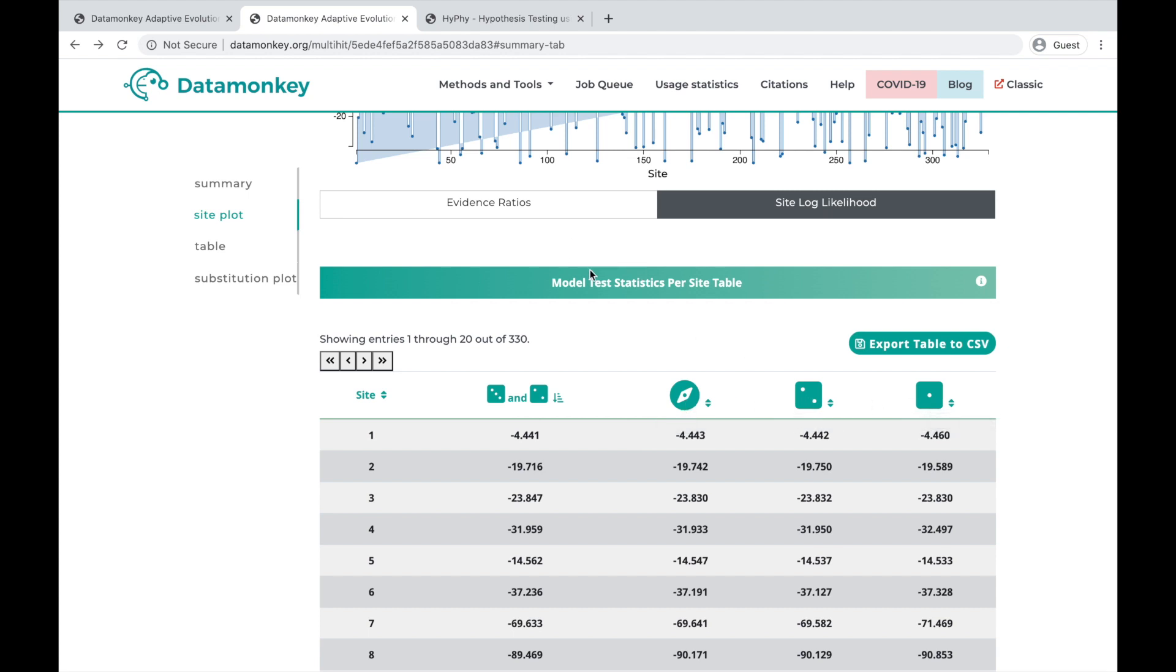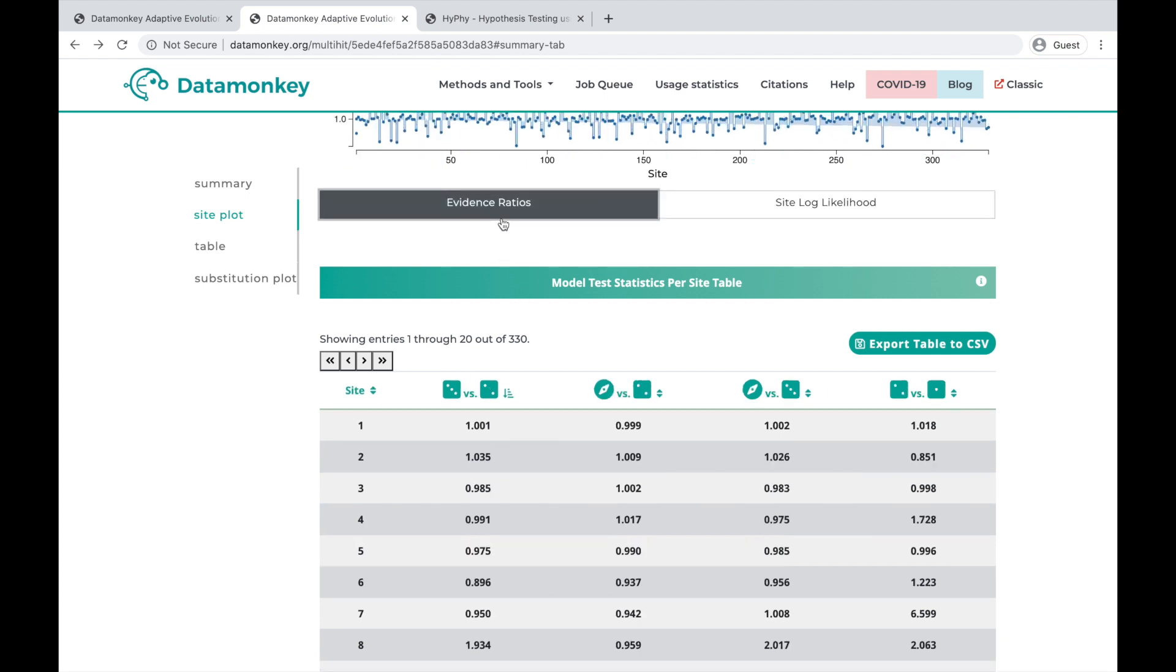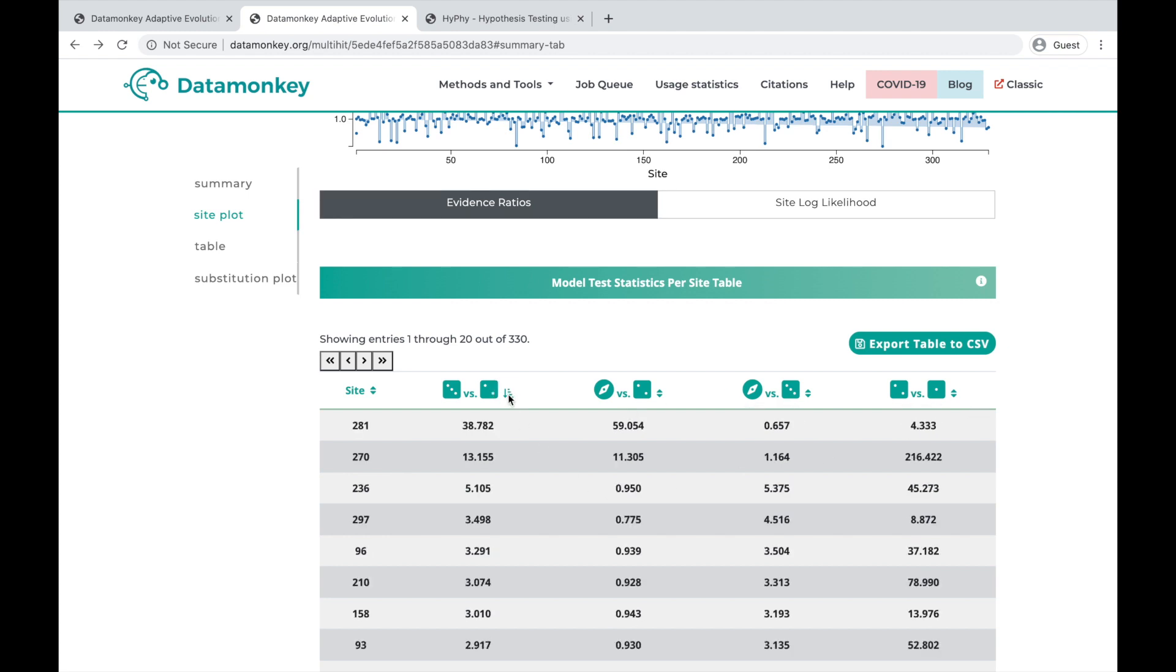And we can actually change what this table is by clicking the evidence ratios. So now we can see this is the table of evidence ratios.